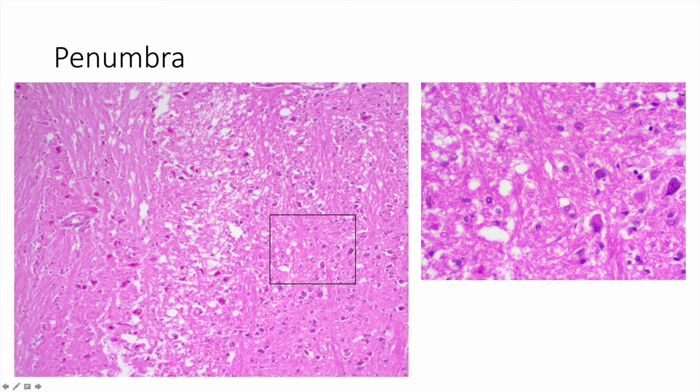Of course, this is the area that we've been most interested in, and this is the area of edema that is actually surrounding the infarct itself. Edema, of course, associated with inflammation. In the live person, this area would have been full of fluid or interstitial fluid, but in this section we're now left with just open space. So this is what edema looks like on a microscopic specimen.